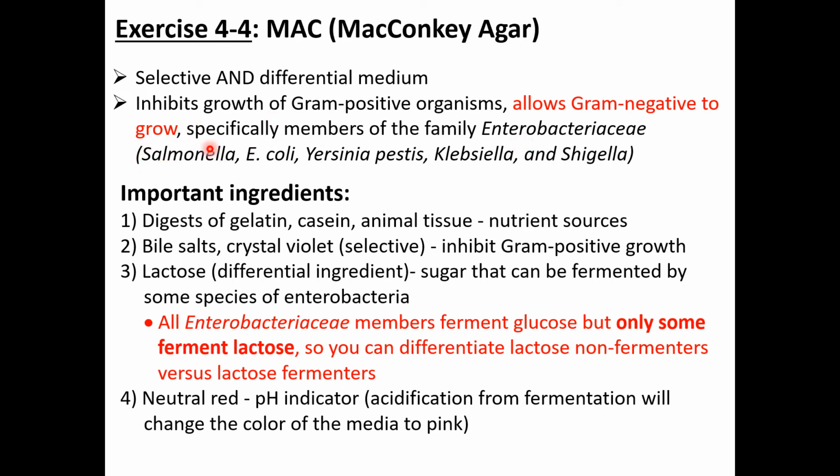And here we have some examples: Salmonella, E. coli, Klebsiella, Shigella, but those are just some examples of species that can test positive on a MacConkey agar, and all this type of media is just a starting point to get to the diagnosis. Okay, it's not going to be just one single medium. You have to run more than one test to know if you actually know what you have.